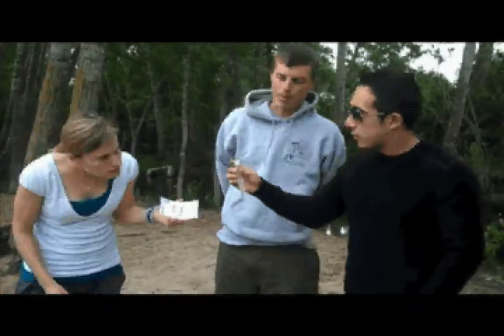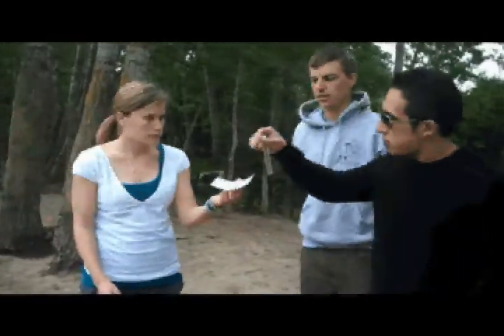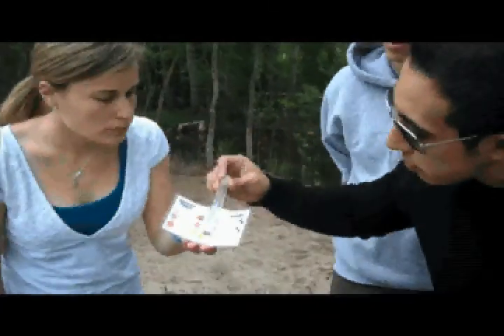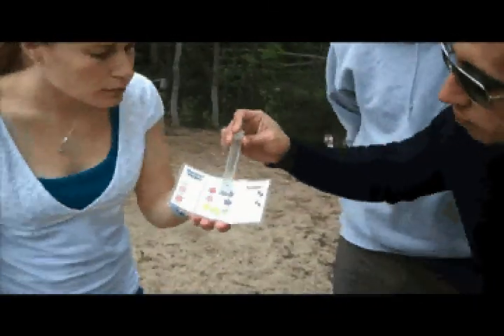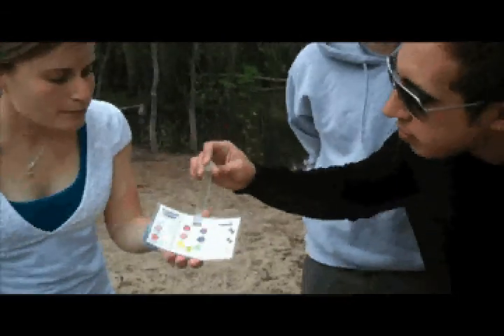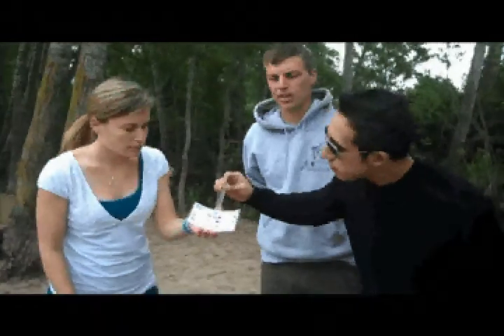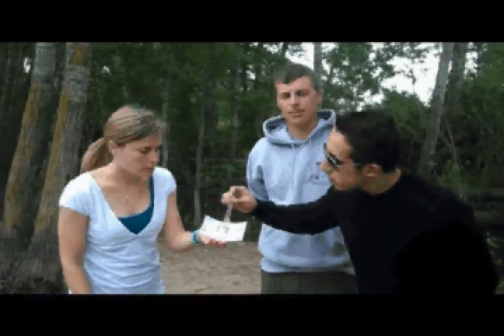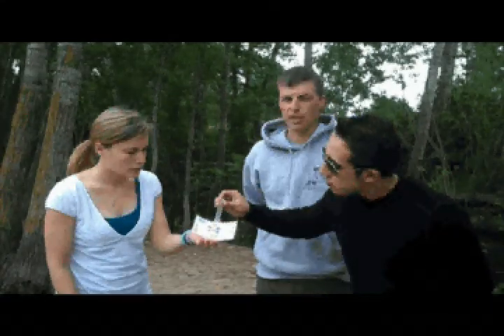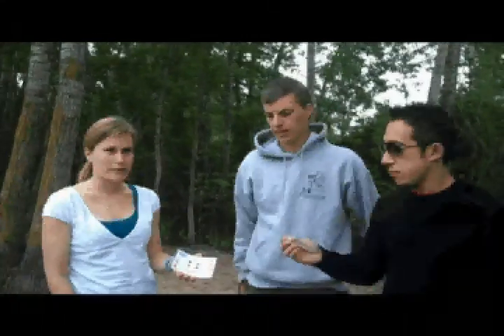So the pH tablet has dissolved and we've had a color change, so we want to compare that color change to our chart. Just hold it right up on top of those numbers and see which one it blends in with the closest. Looks like maybe number 7. Yeah. Okay, so we have a consensus on 7. So 7 is the middle of the pH chart, and the pH chart is based on water as the central point. So it goes from 0 to 14. So 7 is really good. That's exactly what we're looking for. Perfect.